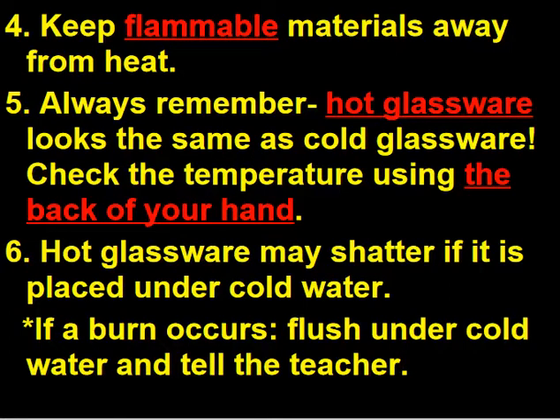And the reason for that: you still shouldn't touch your hand to the hot glassware, but if you accidentally did touch it, your reflexes would move your hand away from the hot glassware, versus if you used the palm of your hand. And remember, hot glassware may shatter if it's placed under cold water. This has happened many times throughout the year, where a student will take hot glassware off the Bunsen burner, put it immediately under the cold water to cool it off quickly, and it cracks.